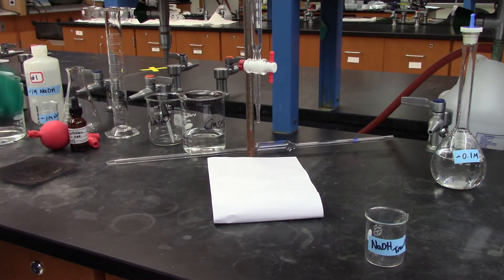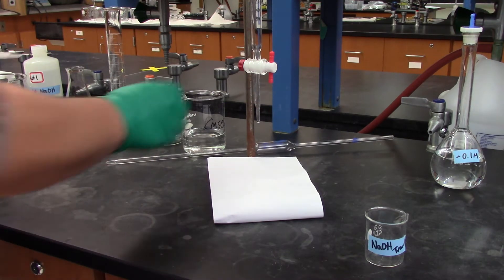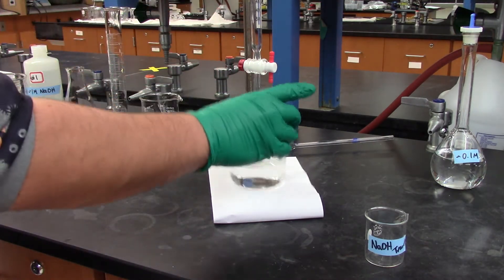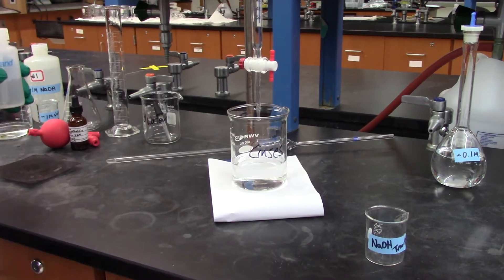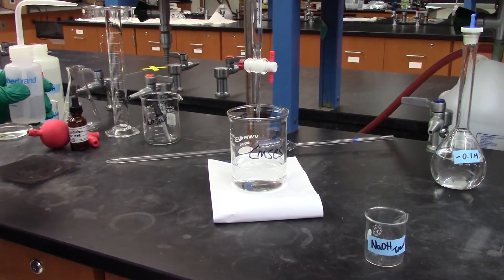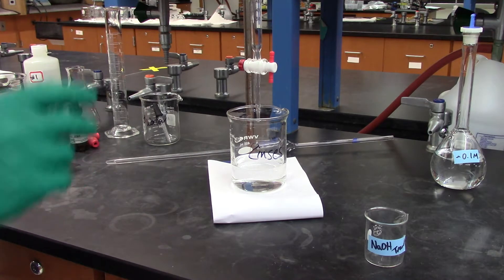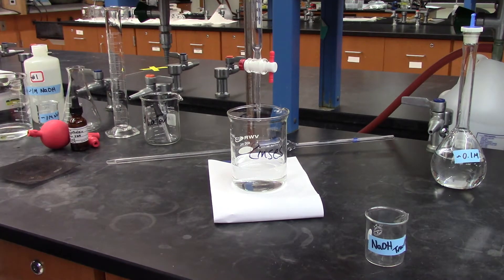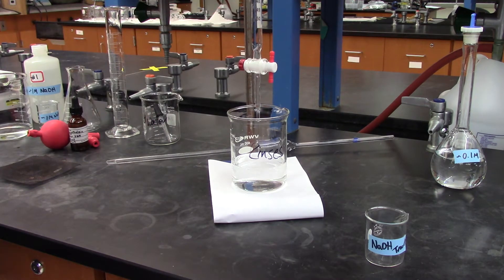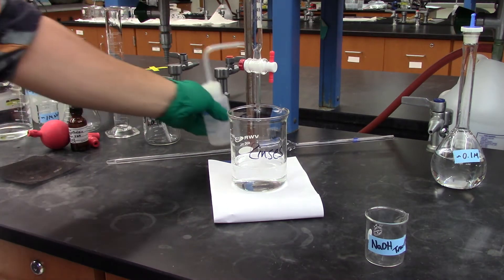So the first thing you're going to want to do is rinse your burette, put some distilled water. The stopcock is parallel to the burette length, so that's going to allow your water to pass through. We'll allow our water to go through there.